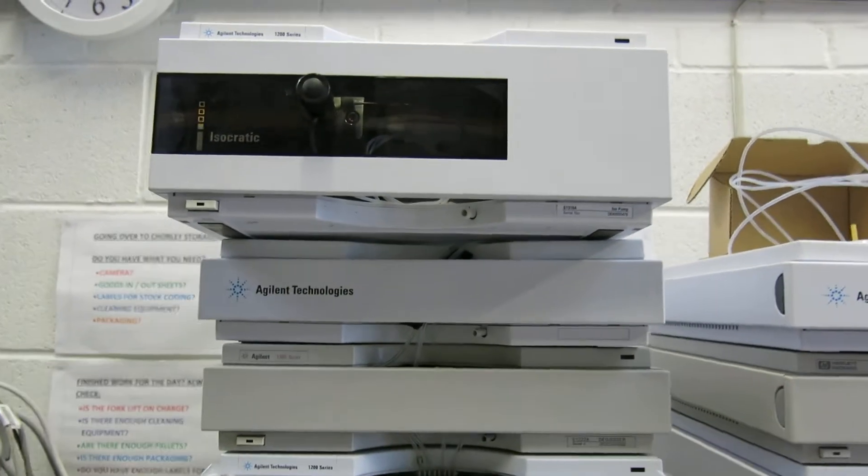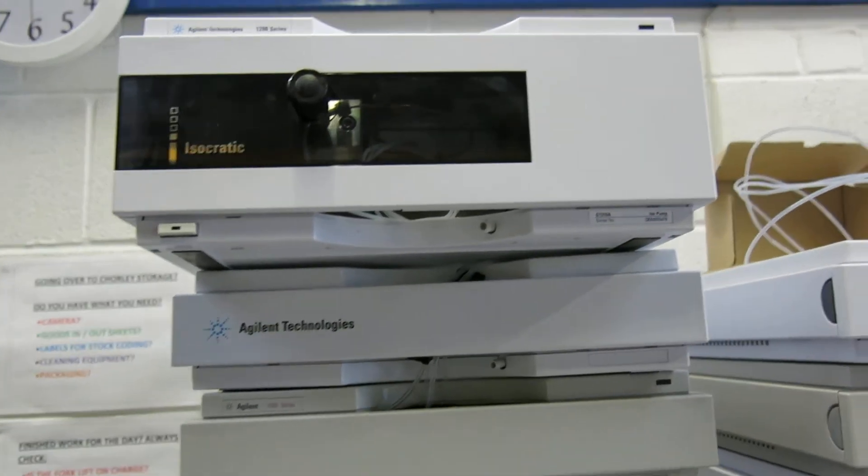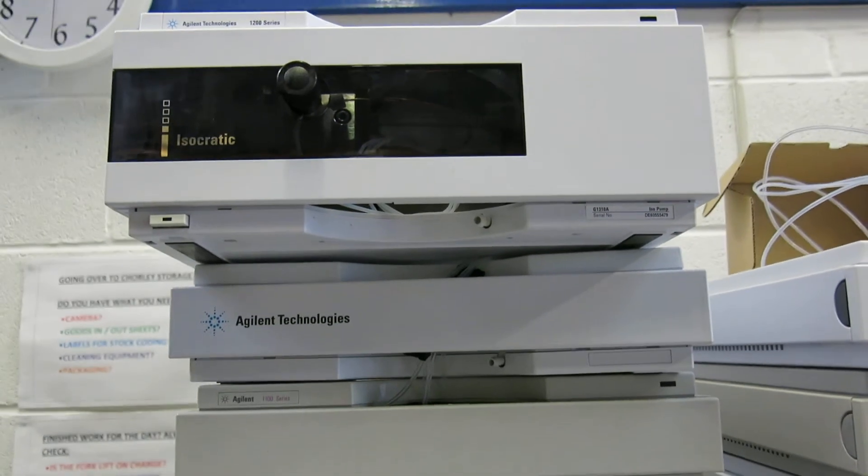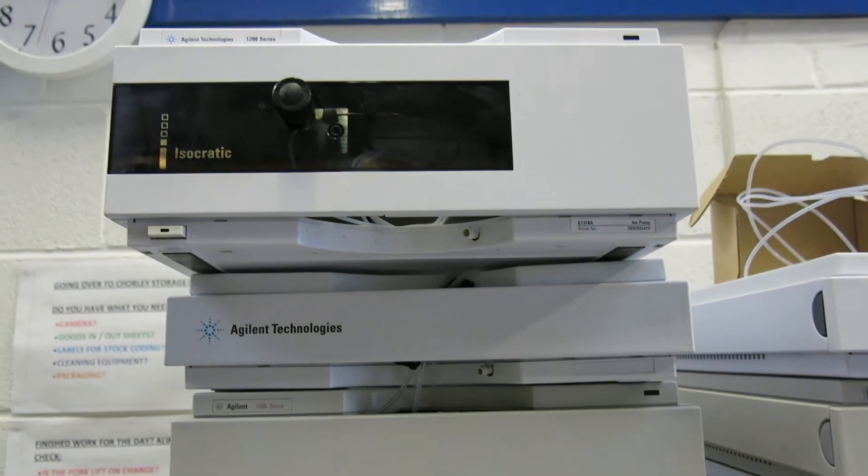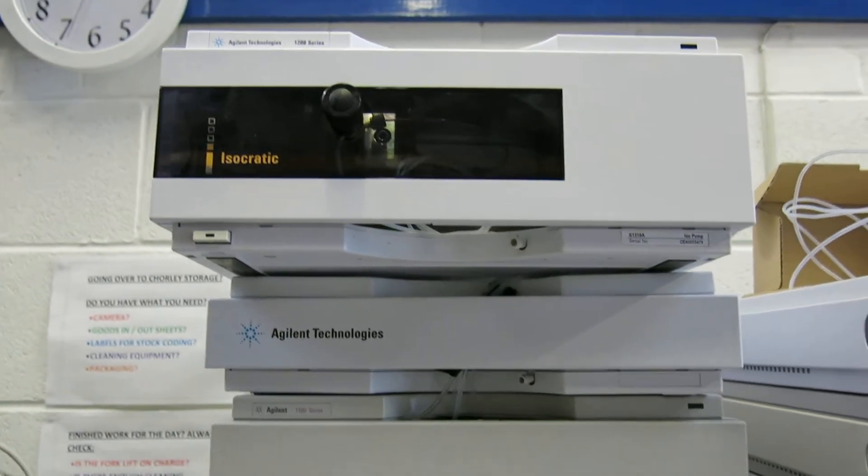This is Nick Edmund, Richmond Scientific. This 1200 system comes with either an isocratic or a binary pump.